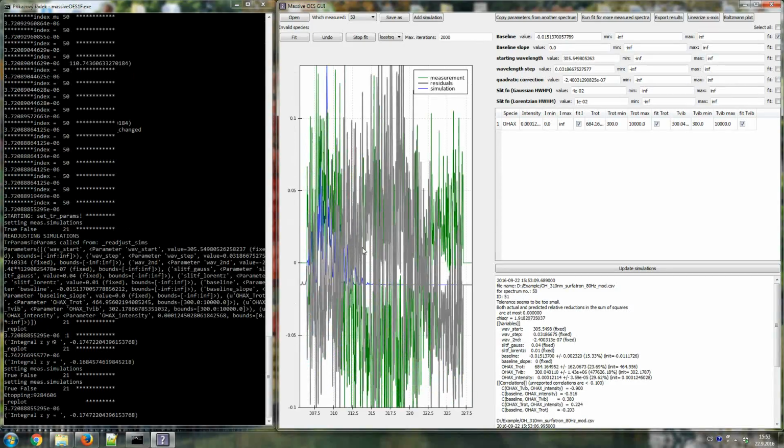Okay, so I've cut the video, so you didn't have to wait to see all the spectra I did, and you can see that at the end of our spatially resolved measurement, we have measured just total rubbish. This is purely noise, and still managed to fit some temperature. So here we have 684 Kelvin plus minus 162, so the error is 23%. This tells you something about the error, because the error is estimated from the residuals of the fit, and if we compare that to what we see here, I think that we can safely state that the error is underestimated.